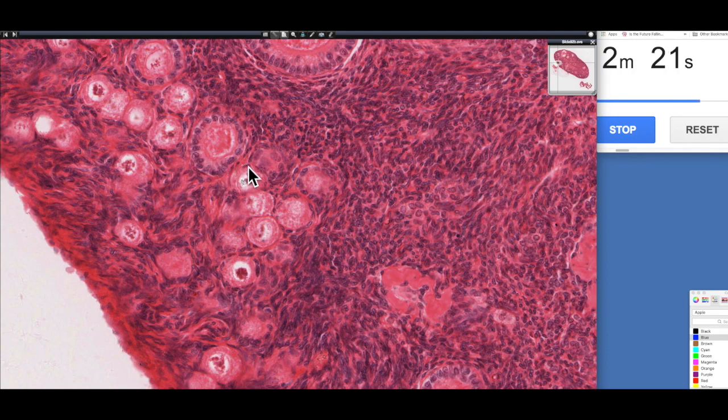At this stage, they're not referred to as granulosa cells, but when the primordial follicle is stimulated to undergo development, those follicle cells become granulosa cells, and they form this single layer of cuboidal, simple cuboidal epithelium. So these granulosa cells. So here's our oocyte. You can see there's sort of two consequences that happen during this early follicular development, this pre-antral follicular development. One is the oocyte grows. The second is the follicle cells grow. So the follicle cells differentiate into granulosa cells and begin to form this single layer of cuboidal granulosa cells.